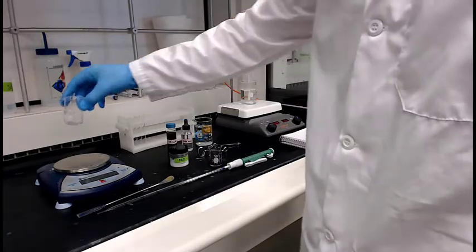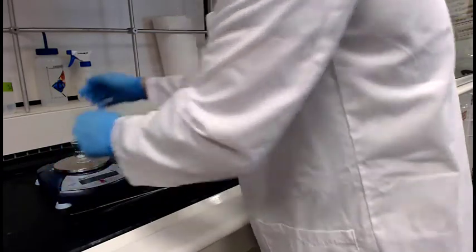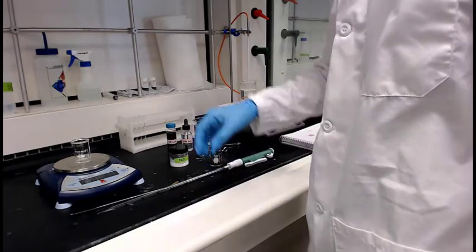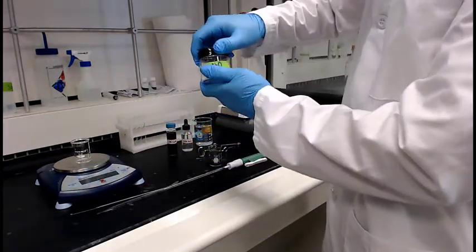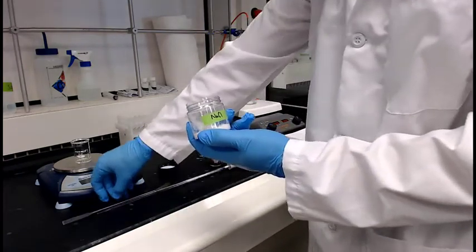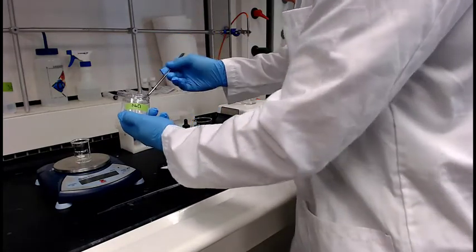He's going to get a weighing beaker. So this is a pretty good technique. He can put that on there. If he wants, he can tare that. So there's a button on there that'll zero it out. That's the tare button. So now it just weighs 0. So any mass that's added in there is going to be figured out on the scale. It's good. He's going to use a spatula.